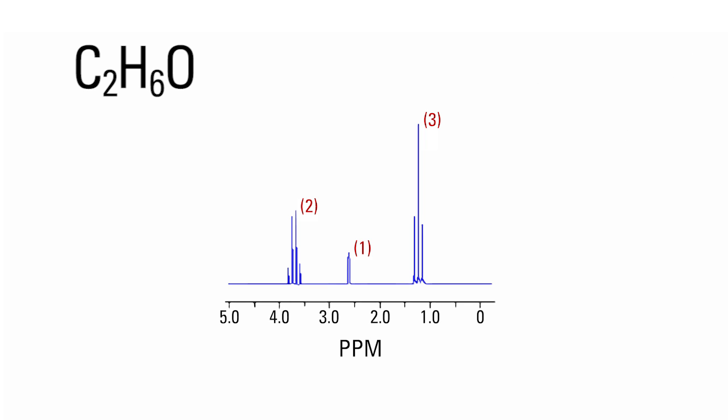In the spectrum, the integration is given as the red numbers in the parentheses. For the group of signals around 1.3 ppm, the integration is three. That means that there are three hydrogens in that molecule that give rise to that signal. The small signal around 2.6 ppm has an integration of one, which means that this is a signal being generated by one hydrogen. The group of signals around 3.7 ppm has an integration of two, which corresponds to two hydrogens.